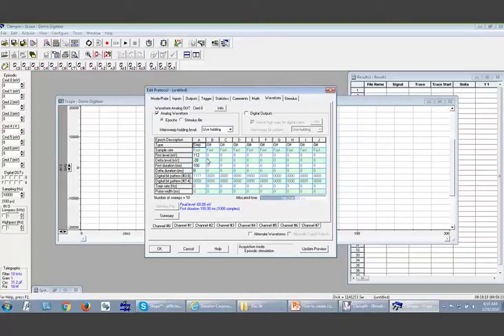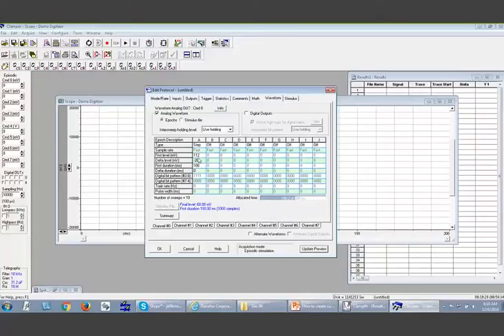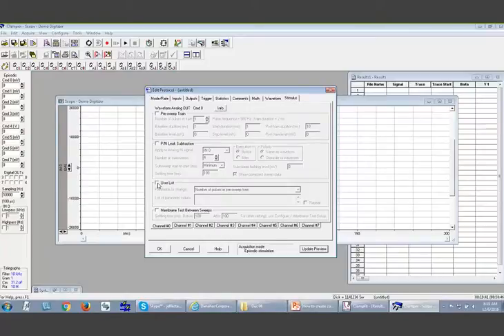Today, like I said, I'm going to demonstrate the holding level. You can see here by default there is a series of this multi-step. You can see there's a step here. Now I want to change the holding level for each sweep. Now I have 10 sweeps here. Now I go to the stimulus tab. You check the user list. Now you select the parameter that you want to change. Now epoch A level.